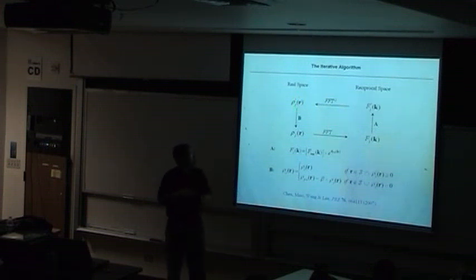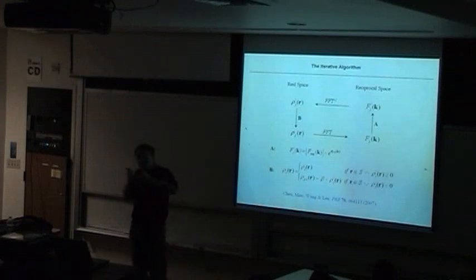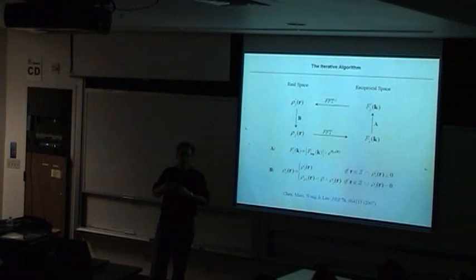And we modify the electron density because we know that some region must be zeros, and inside the object should be positive. We call it a physical constraint. The physical constraint is very, very important.